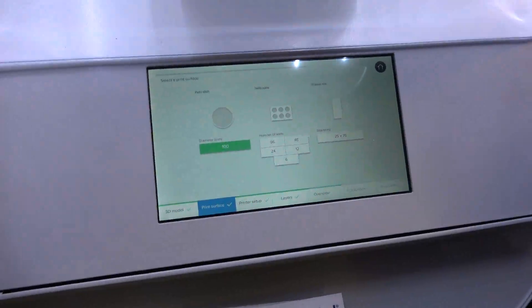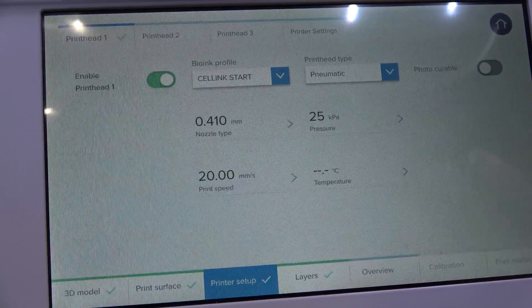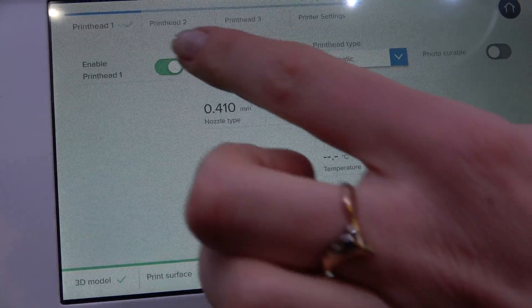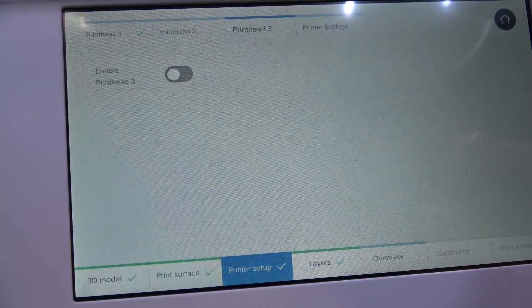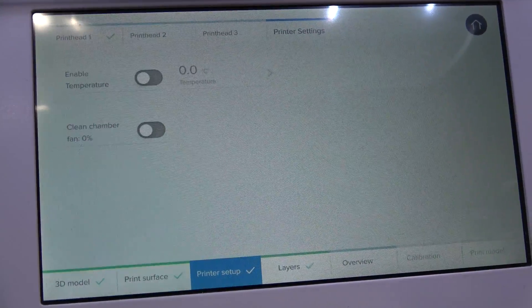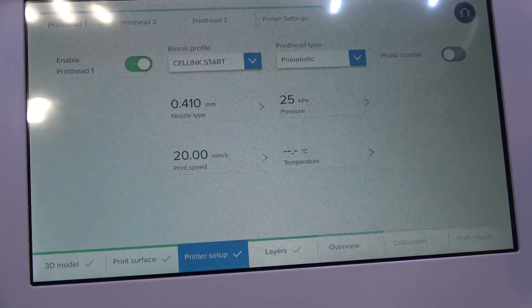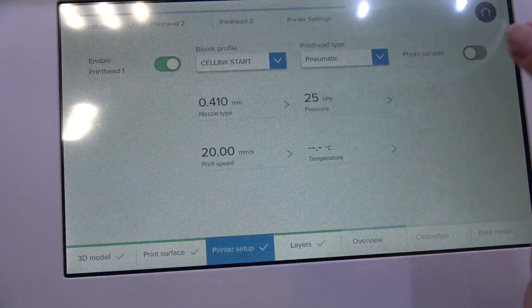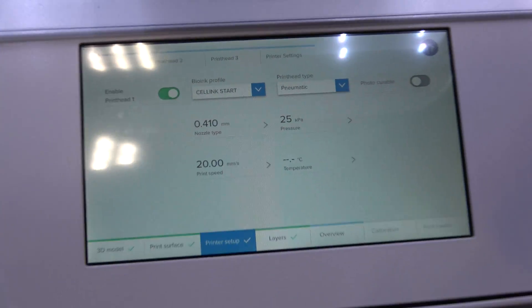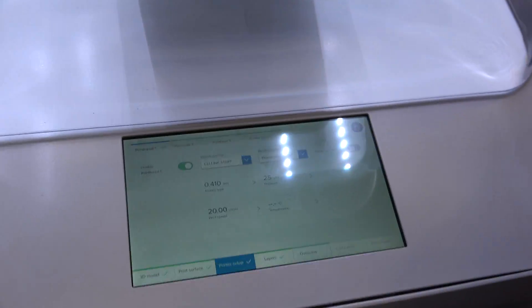The next step is your printer setup. Here you will choose which print head you want to enable. You have three different print heads and also the print surface or print bed. We can choose to print with only one print head. The material we have in the cartridge is preset, so all the settings are already in there.